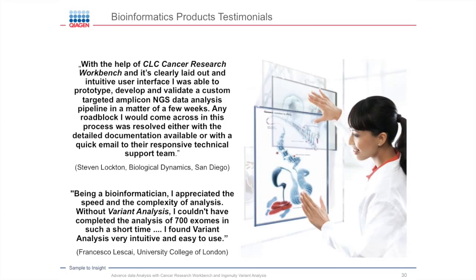So it's a lot of information from this presentation, but I hope it gave you an idea of what you can do with the bioinformatics product using the cancer workbench and the variant analysis. And I want to end the presentation with some quotes from our customers, and I'm not going to read them, both for the different products, about the cancer workbench. It's really time. Data analysis that was taking weeks is now taking a few days. We have a support team that is there to help you with the different products.